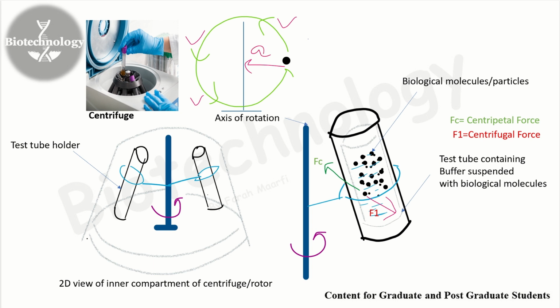So when these two things exist, then a force occurs that holds the particle in a circular motion and is always acting towards the center, and this force is called the centripetal force. Opposite to this force there is another pseudo force that the particle is experiencing at the same time, and this force is called the centrifugal force. The centrifugal force is responsible for the settlement of the biological particles when rotation is applied.